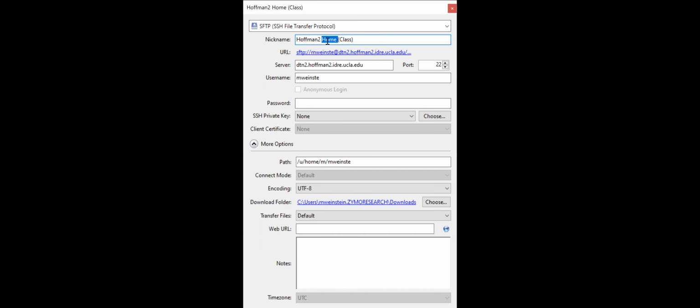All right, so we're going to change the name from Hoffman 2 home to Hoffman 2 scratch. And again, I just have class there because I already have these links and I don't want to get rid of them. We're going to keep just about everything the same, with one exception. We're going to change the word home here between those slashes to scratch.